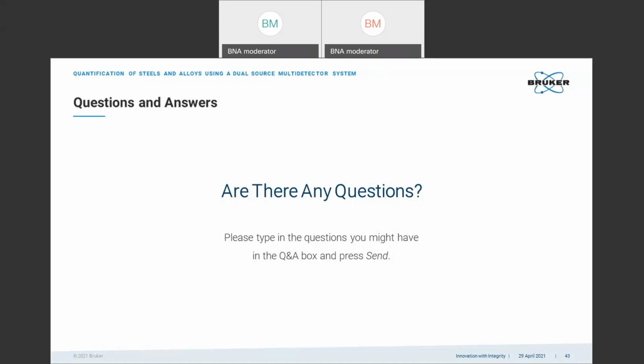So it's quite a long measurement time to get good statistics, good and precise results. But at the end, for EDS, for good analysis, it also takes time. You just get a first idea with a very quick analysis, but for precise analysis, you need time.